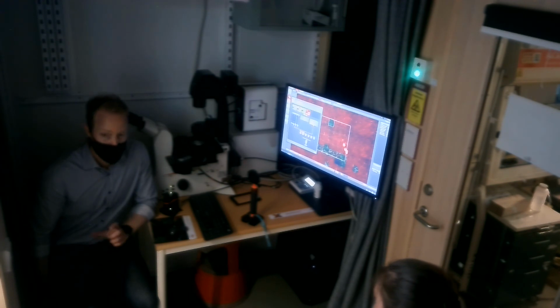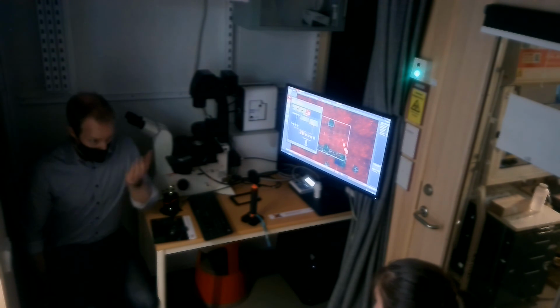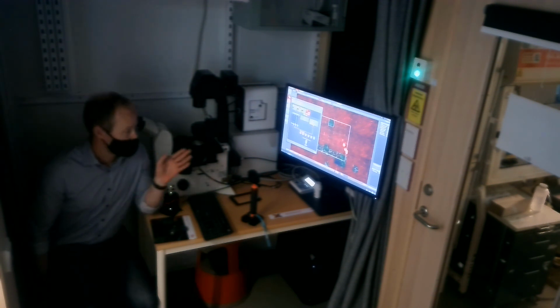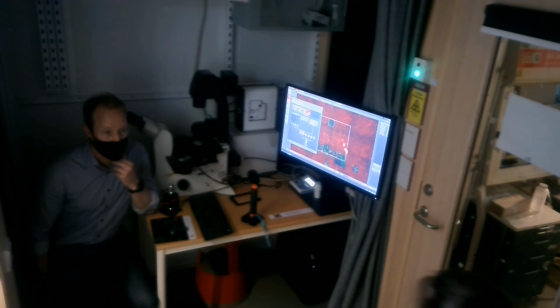If it's very light sensitive, that's also something to consider, because then you might not want to do an autofocus, because that exposes your sample to light. So in those cases, I might go for that. But I would say that if I had sensitive material, I would probably use a focus map instead to take care of that and find the focus like that.